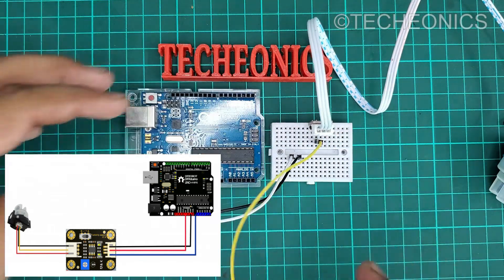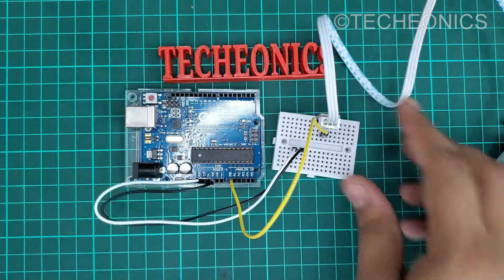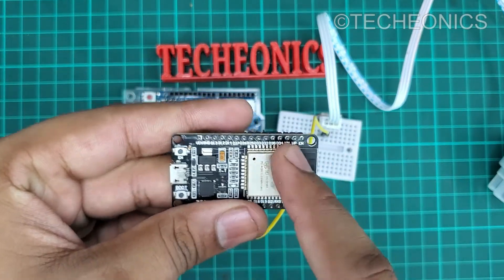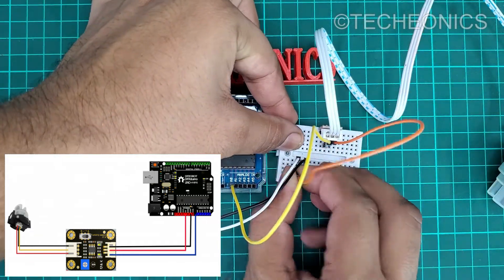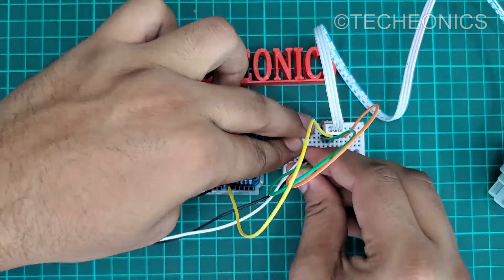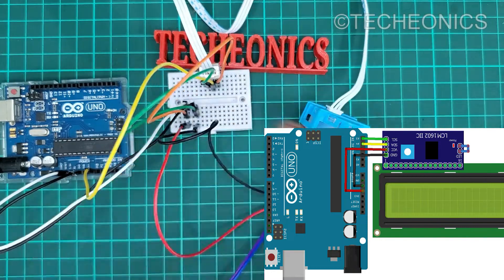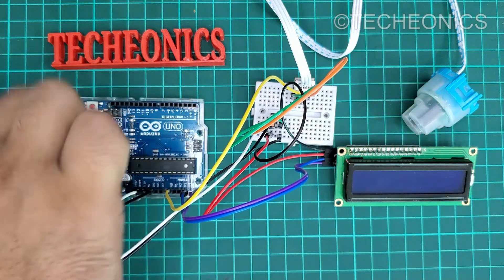Connect the signal pin to the A0 of the Arduino, and if you are using the ESP you can connect the signal pin to the ADC pins 33, 34, and 36. Connect the LCD with it. Now, connect the Arduino.